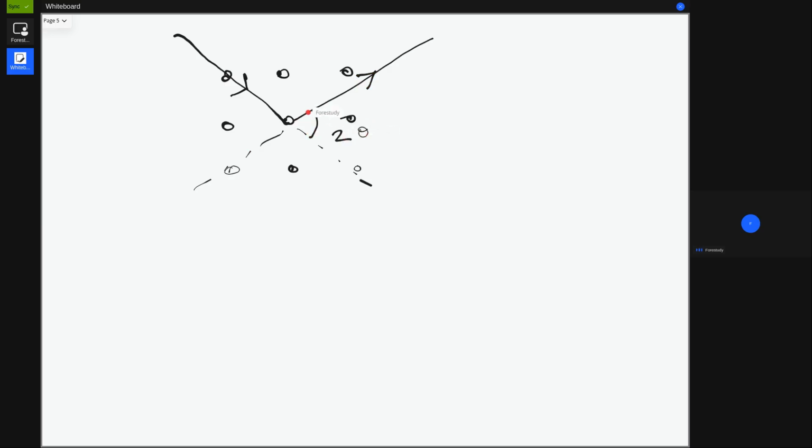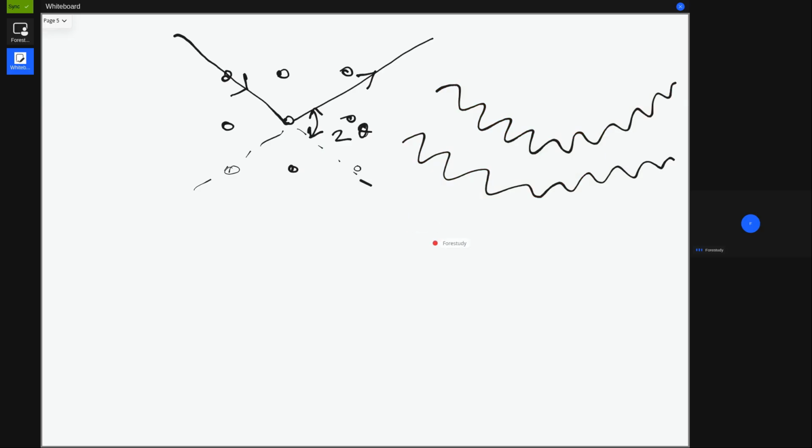At specific angles, this diffracts. Let's draw this so that I can derive Bragg's law. It's a tough diagram to draw, but still I'll try.